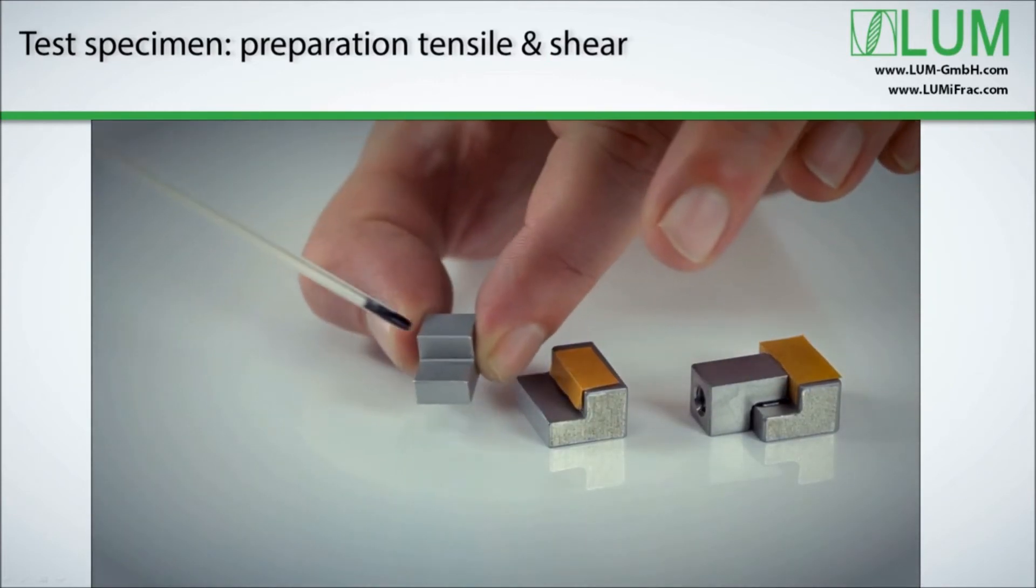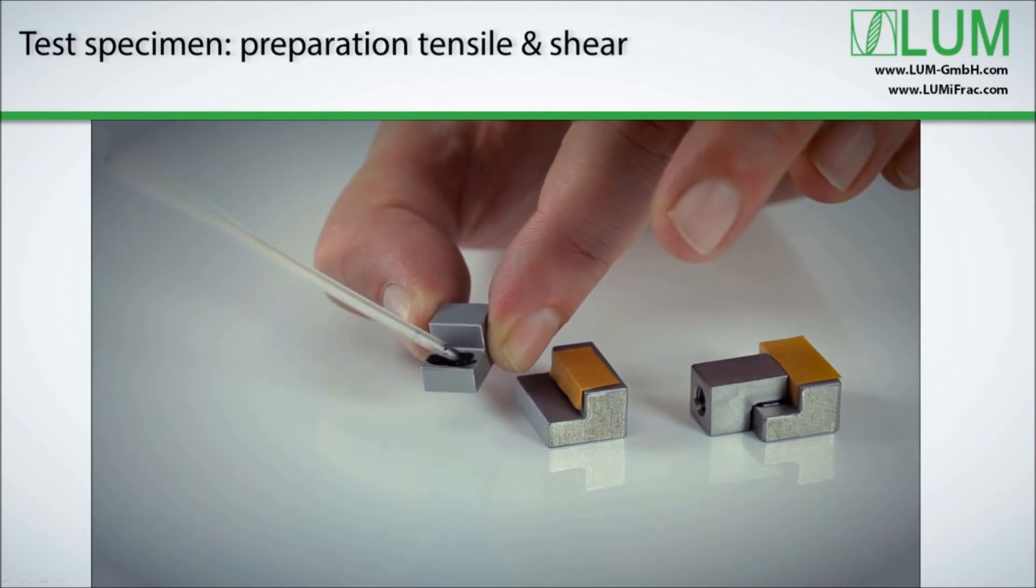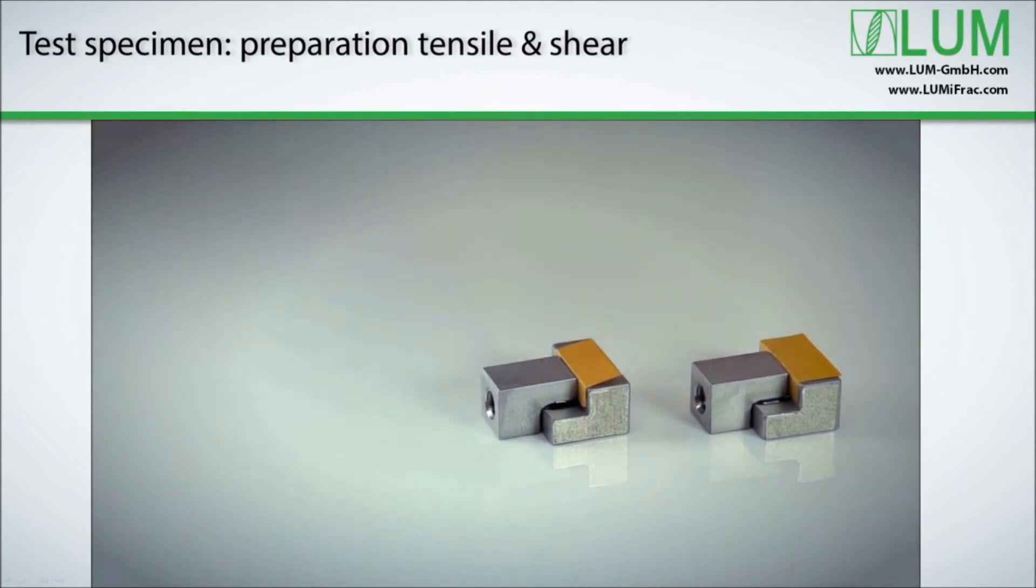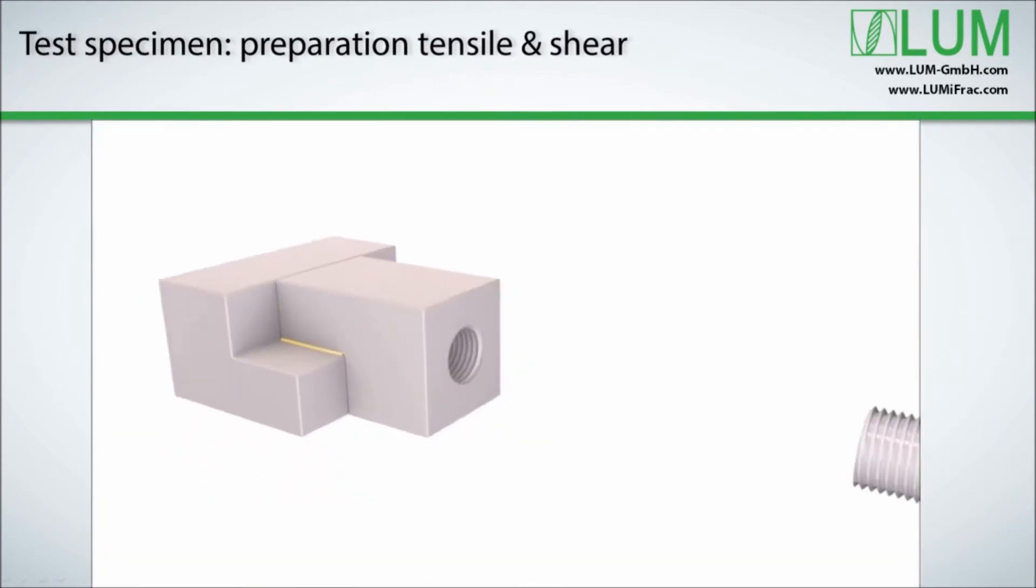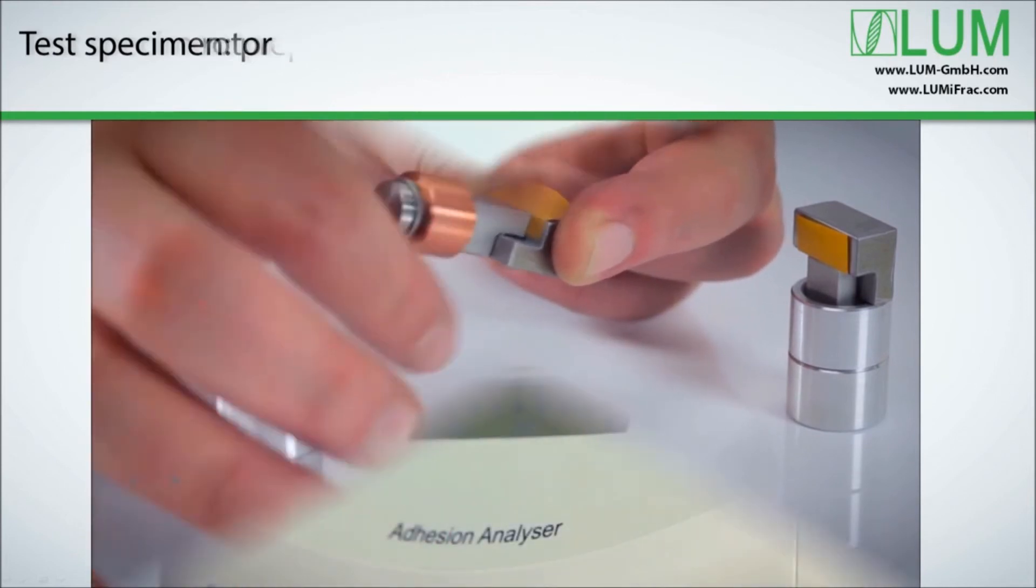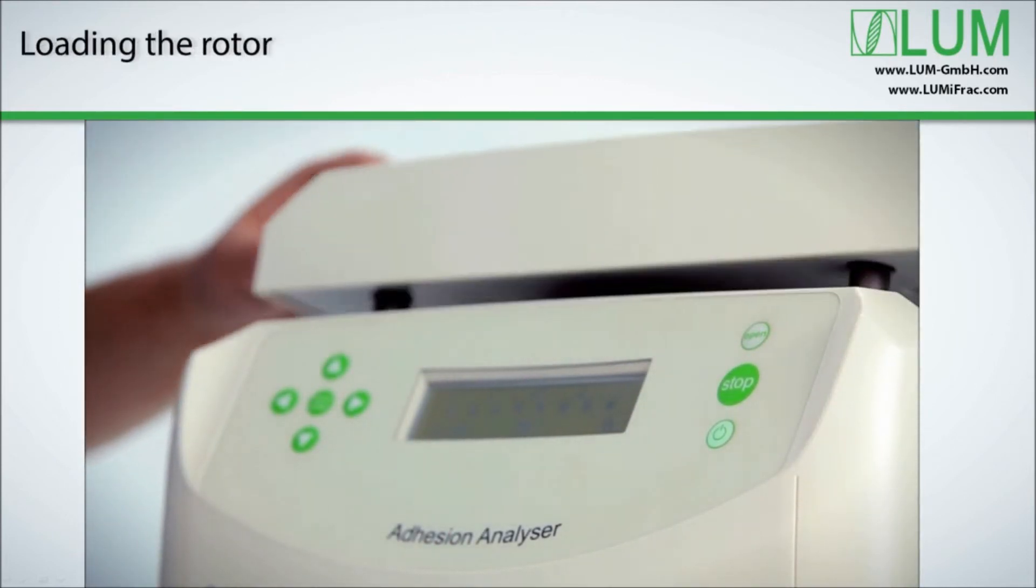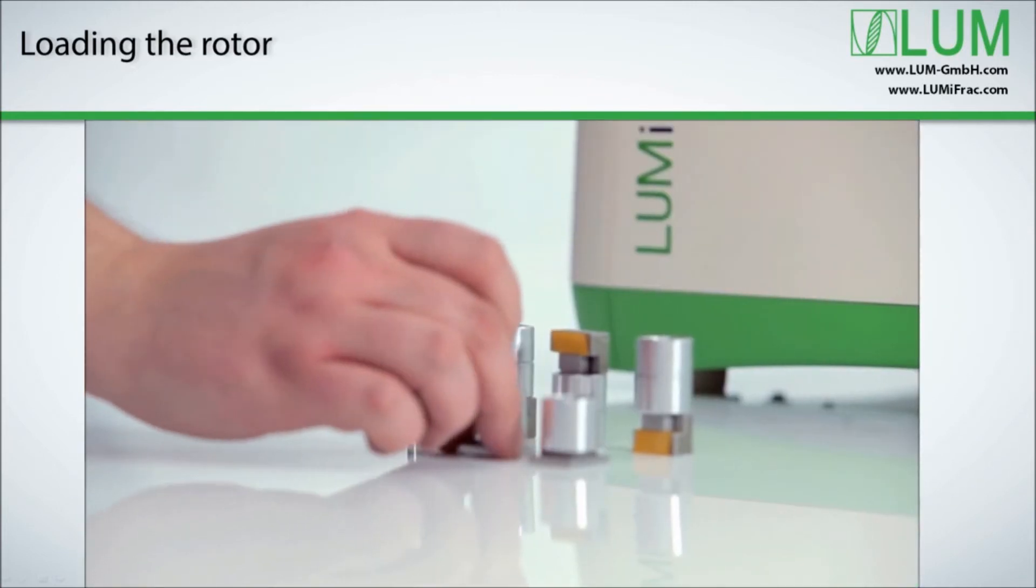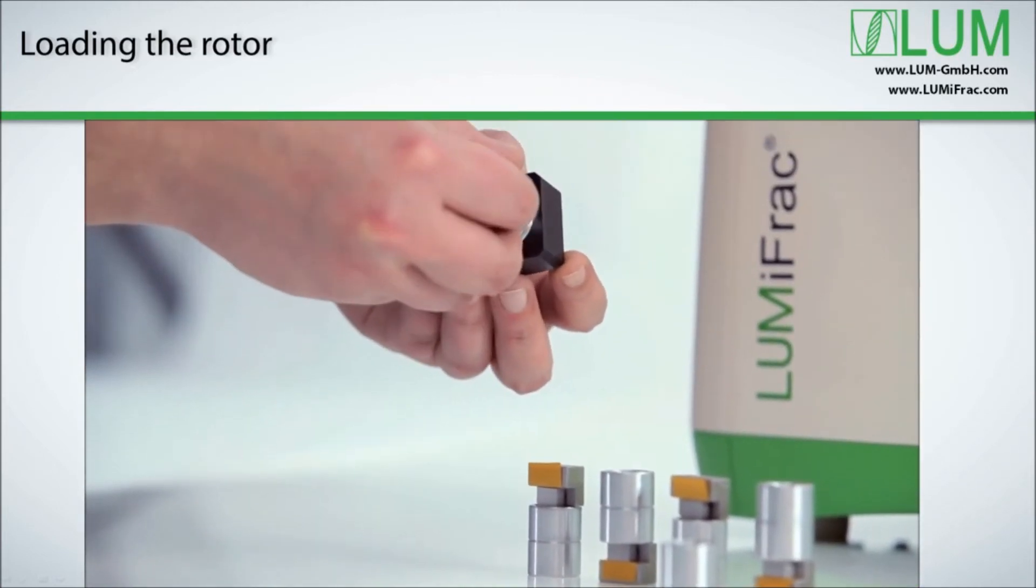Here you see shear specimen preparation for real. In this example, the yellow release paper is used to ensure bonding of the shear area only. Prior to testing, the mass body is assembled by a set screw and the guiding sleeve is slid on. You can see how simple preparation and assembly are in our case. Now that we have prepared the test specimens, we can move on to assembling them and proceed putting them into the detection modules which are housed in the LumiFrac.